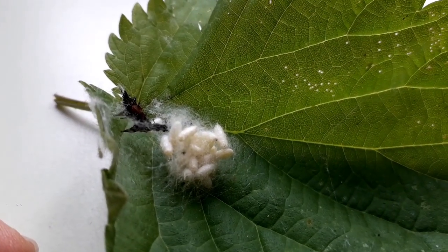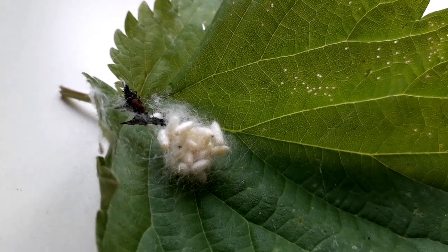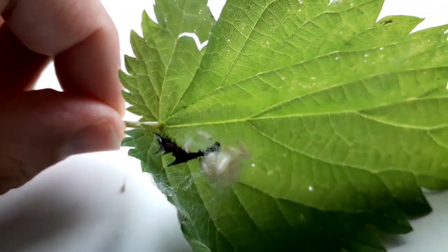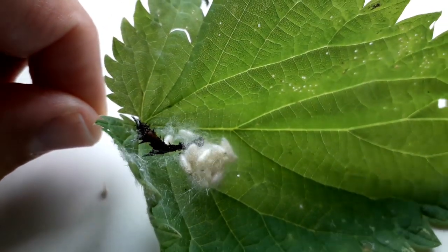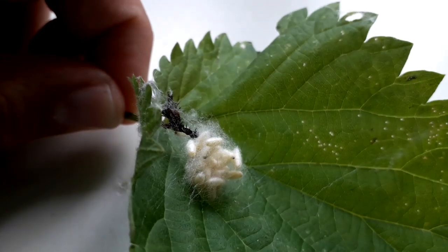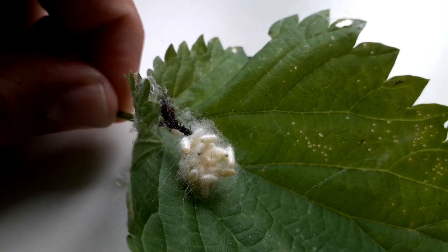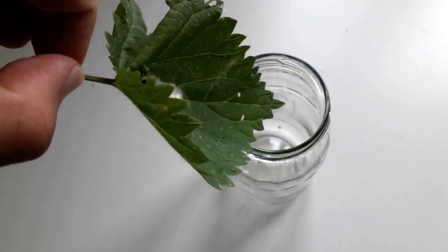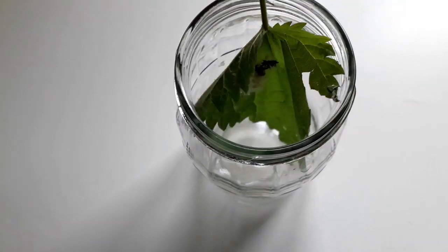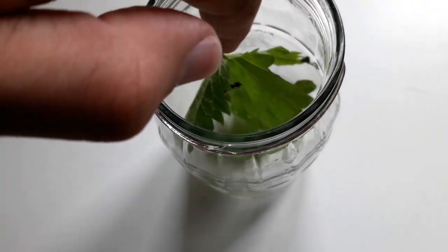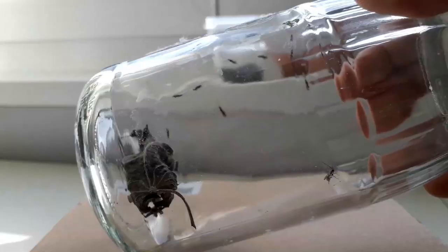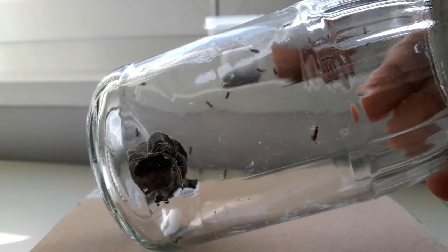So now let's have a closer look. The white fluffy stuff that you see here, these are the cocoons of the wasp and the black shriveled structure is the dead caterpillar. The cocoons have metamorphosis happening - the larvae develop into adult wasps. I wanted to monitor this process, so I conserved the leaf with the cocoons, put it into a glass jar with a lid, and waited until the wasps emerged.